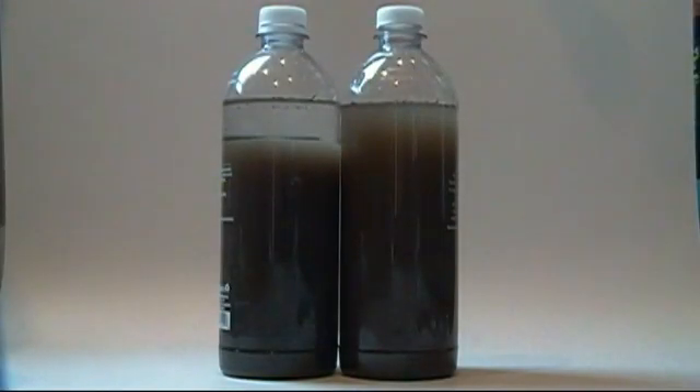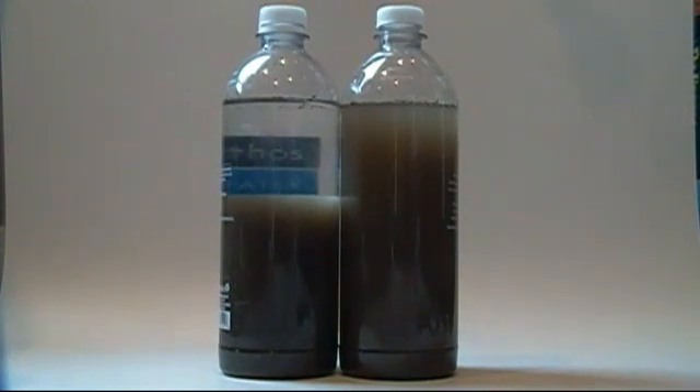Hello, and welcome to another video from ChemKit Depot. I'm your host, Maya. In this video, we will be purifying water using aluminum chlorohydrate, a flocculent.